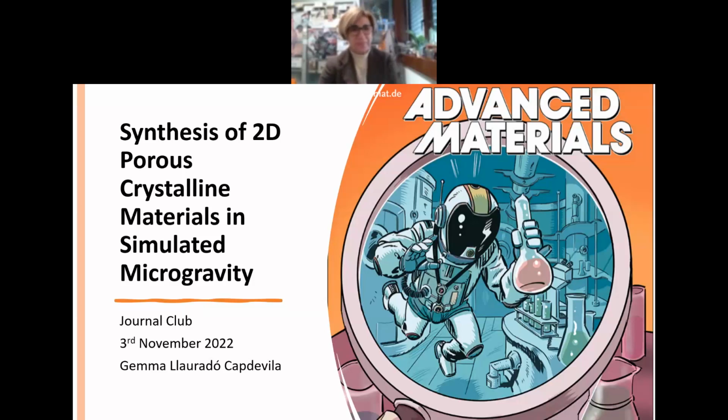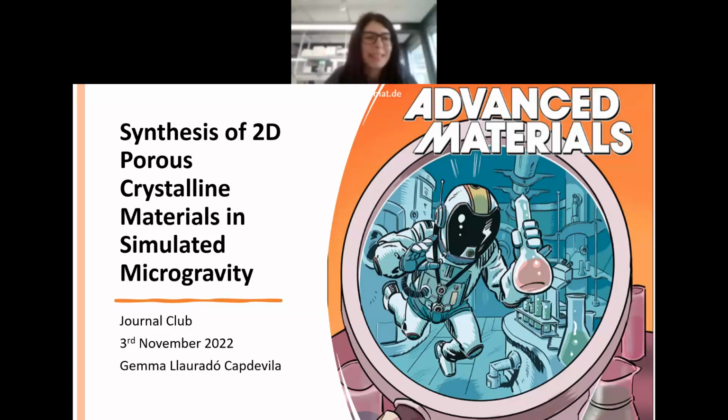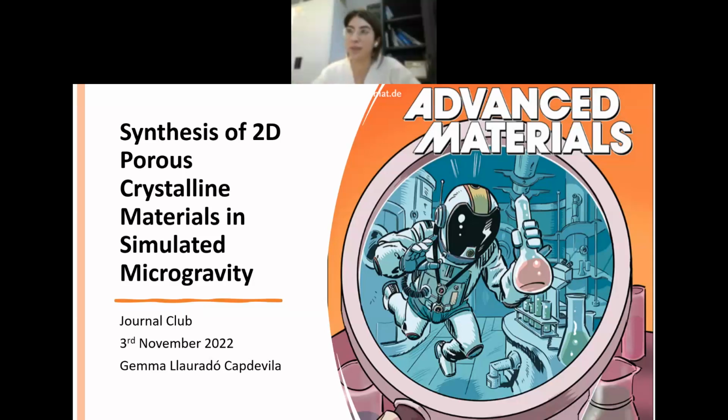So I also have a question. It's not related to the paper, but in general on these devices. Do you think that these microfluidic devices one day could actually be used in industries, for example? I think there are industries that work with it, but I don't know. For the synthesis that they do in this paper, I don't think it's been worked on enough that it can be scaled up.